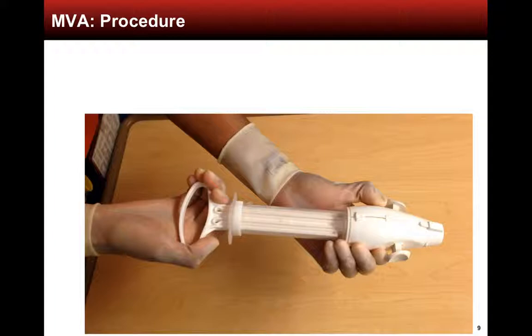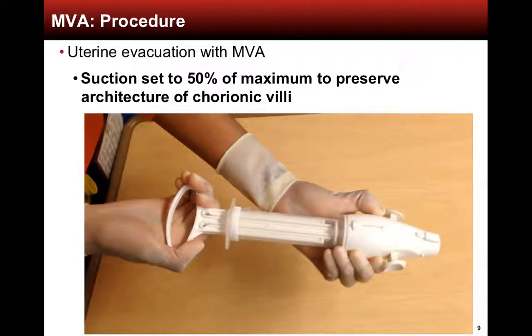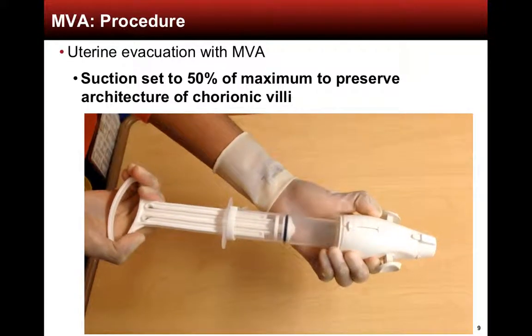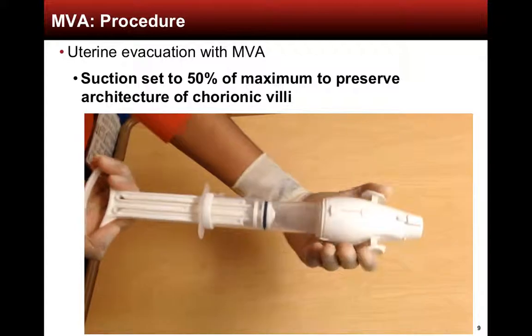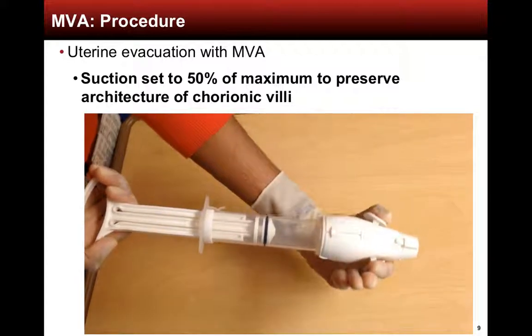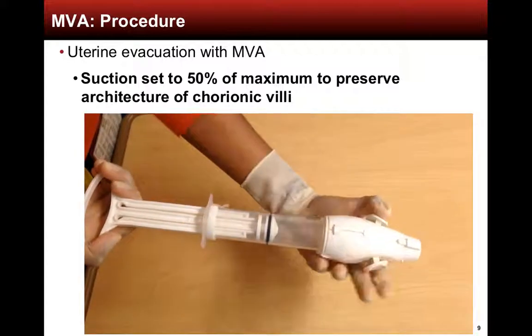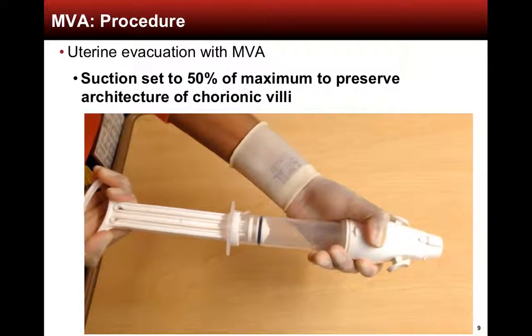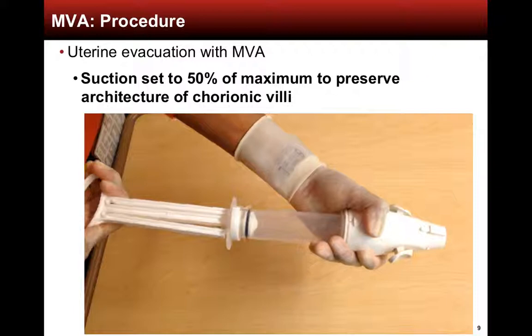To prepare the syringe, set the plunger, as shown in this video, to 30 cc's or halfway, before depressing the tabs at the top of the aspirator and then engaging the suction.